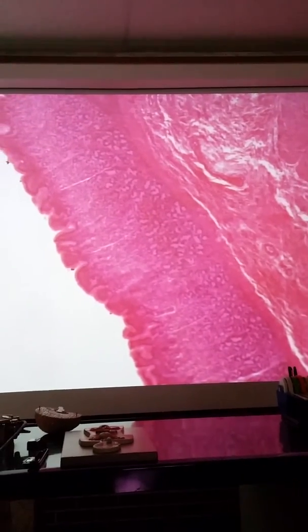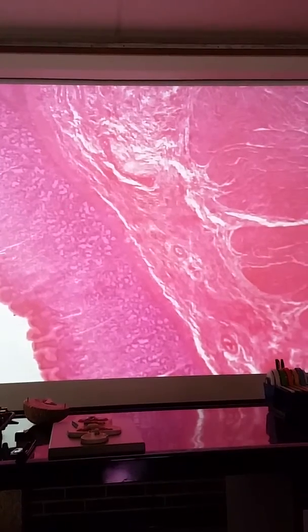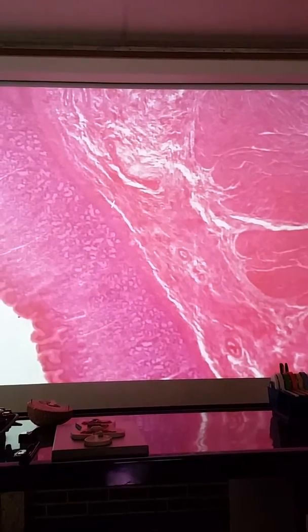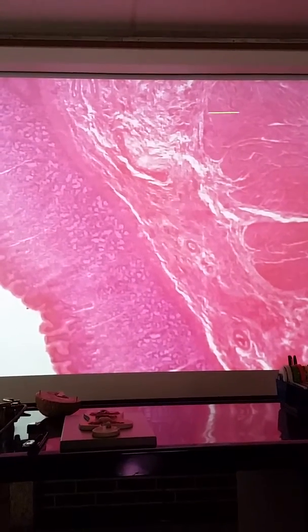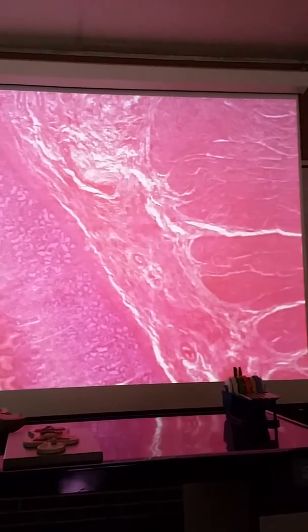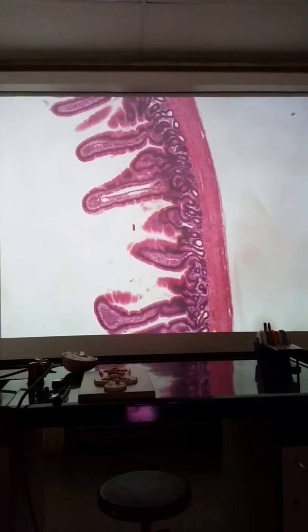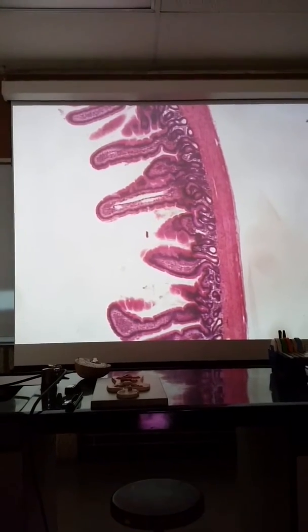Submucosal. So you have mucosal. We're going to go submucosal. So that's through here. And then you run into your muscularis. The rest of this is muscularis. You can see all that smooth muscle there. Like gastric pits. Yes, it is. We're just in the mucous membrane. You got mucous membrane, that outer portion of it. Okay. So we don't self-digest. So from this view, you can see all 4 tissue layers.